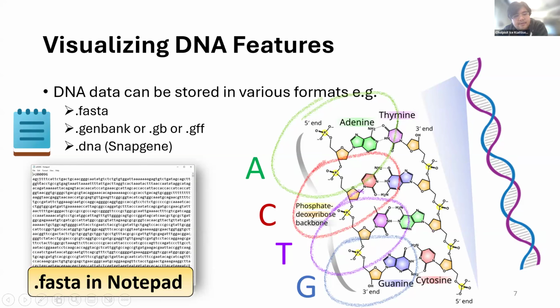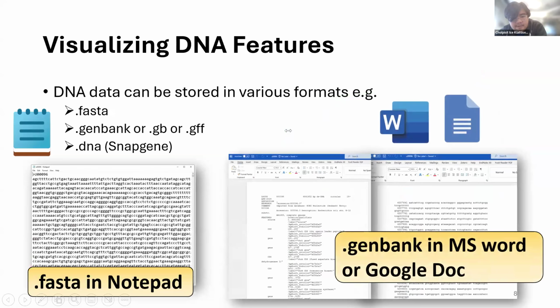Even though we have this set of characters that shows how the bases are organized from left to right, it doesn't really capture the actual DNA structure, because DNA has another strand that is complementing. And it's not just a copycat, it's a complementation. A will bind with T and C will bind with G. If you have a proper way of reading it, you should be able to encapsulate the other strand's information as well. That's why Microsoft Word or Notepad is not the best tool, because it will give you only one strand of the DNA.